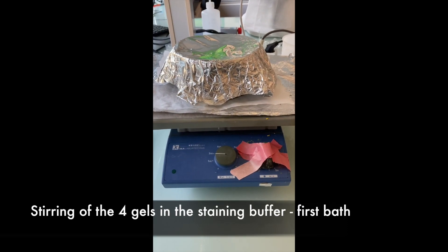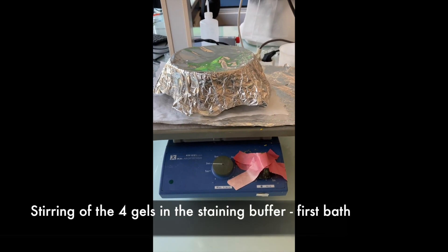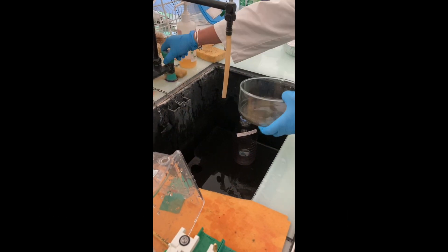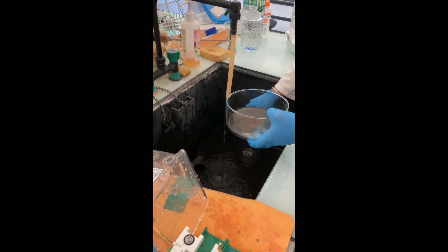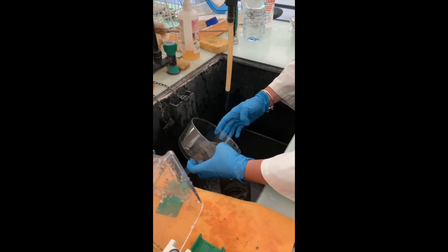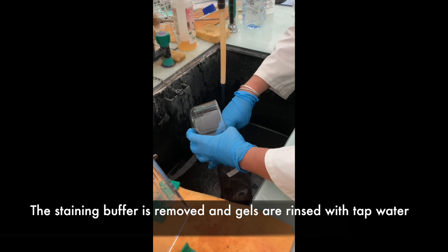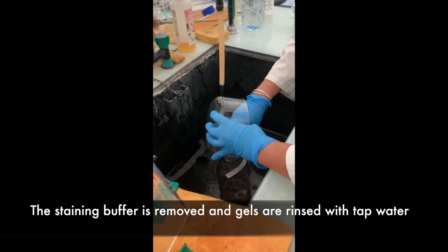The gels are shaken in the buffer for a first bath in the dark until a black deposit forms on the surface. The buffer is then collected for disposal and the gels are rinsed with tap water.